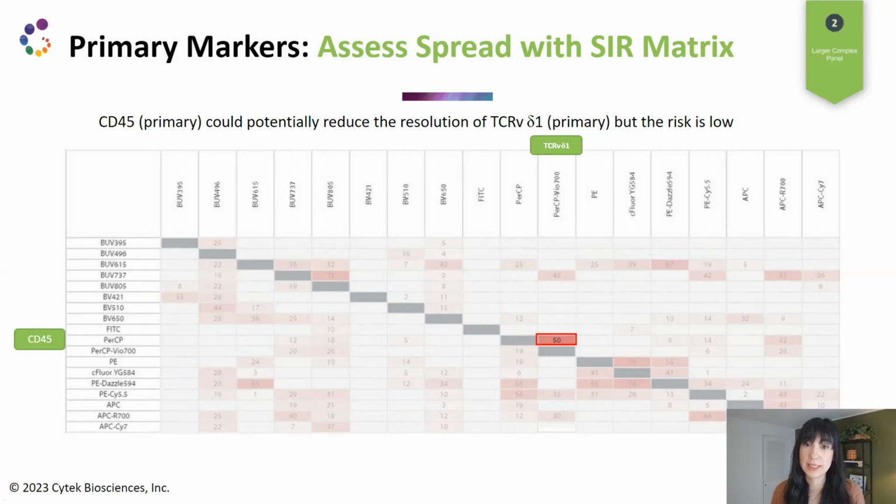So that's another consideration to take in. And then also, what's the value in the box? So the value there is 50. This value is a percentage, so it's out of 100%. So 50% out of 100% is not the highest value. It's like an intermediate value.